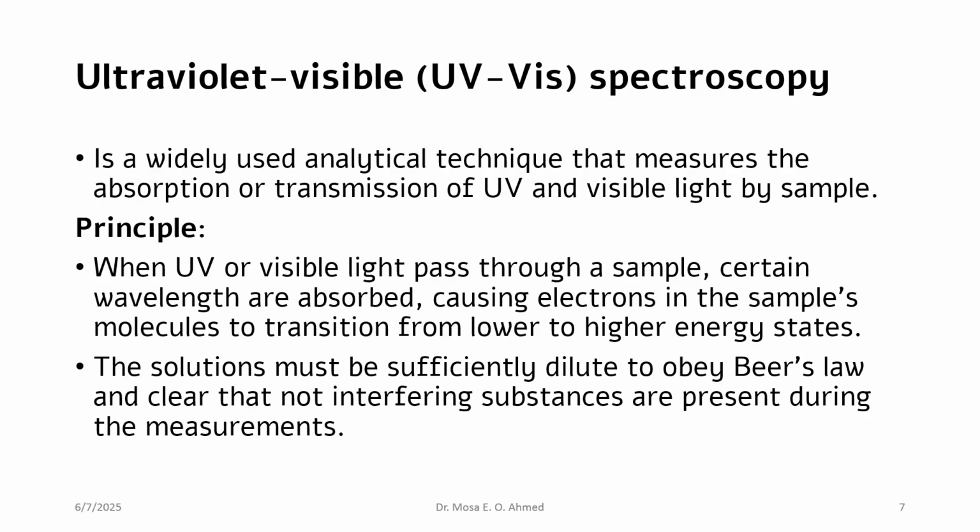Also, in the principle, in order to determine the structure of a functional group present in a compound, the solution of the sample should be very dilute. So, in this case, the solution obeys Beer's law. We must be clear that no interfering substances are present during the measurement.